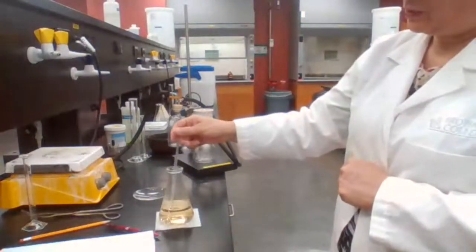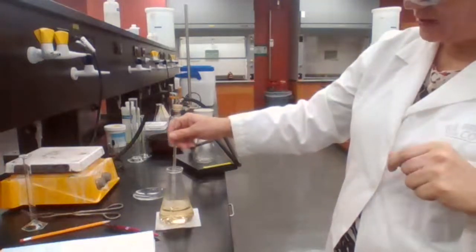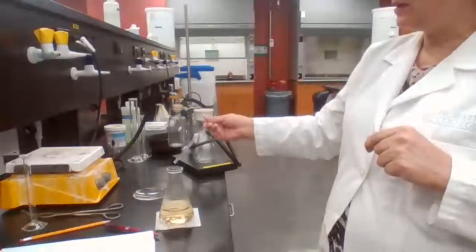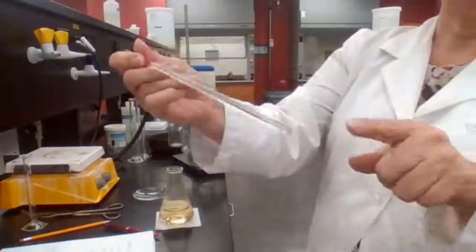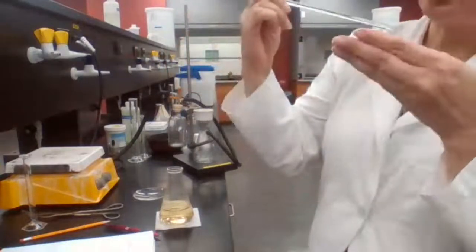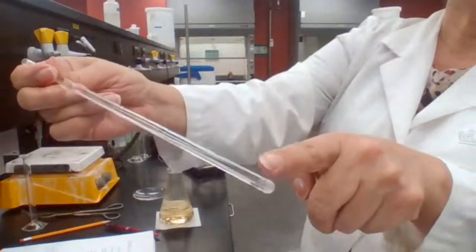And I want to show you what I was talking about when you take the stirring rod out. Since you have a solution, a mixture of solid and liquid, the solid will remain on the stirring rod, and the liquid portion is going to evaporate. So after the solvent is evaporated, see, it's not clear anymore.